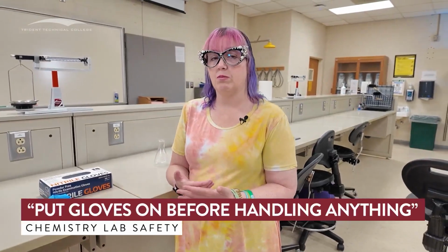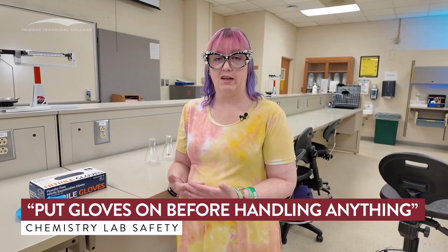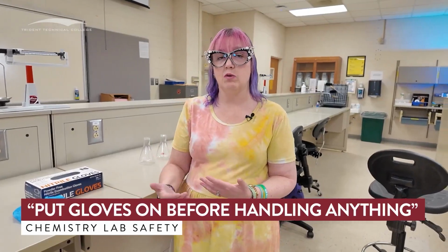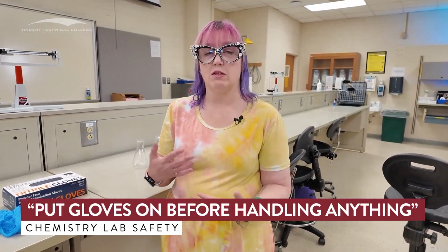Now, things that we need to make sure that we're dealing with when we talk about these experiments. We put those gloves on before we handle anything, because you may not be the first lab for that week. So the things that we're dealing with may not be as clean as we want them to be. So we want to make sure that we're dealing with everything in gloves.